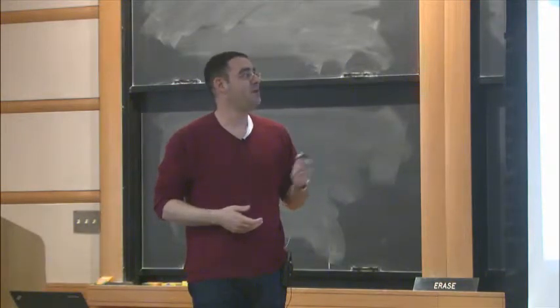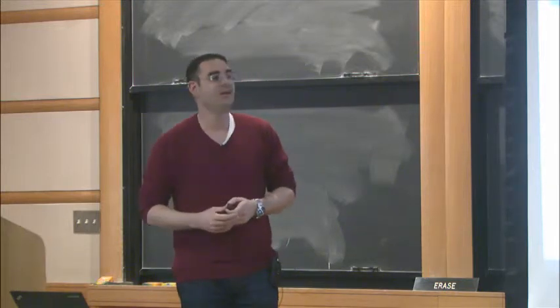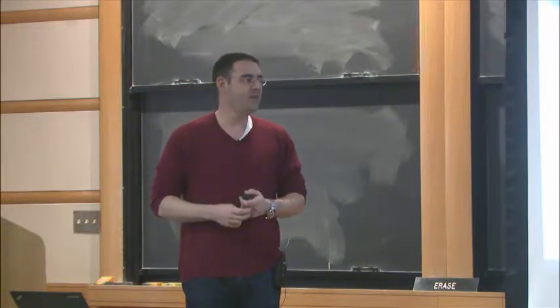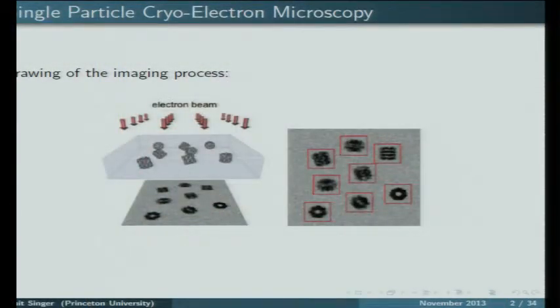So what we're discussing is a problem in covariance matrix estimation for a particular problem in imaging in structural biology called cryo-electron microscopy. First I would like to describe what cryo-electron microscopy is, so we know what problem we're trying to solve. For those of you who are expecting random matrices, don't worry, they will come, but in the second half of my talk. So if you only care about random matrices, you can go to sleep, and I'll wake you up when needed.